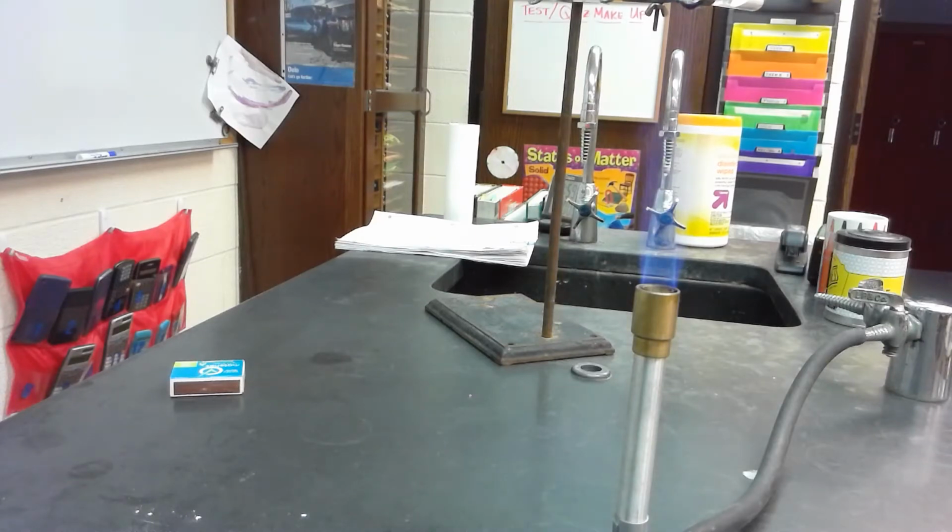All right, the last two reactions we're going to do are reaction 4 and 5. Reaction 4 is zinc and hydrochloric acid. Place approximately 2 milliliters of dilute hydrochloric acid into a test tube. To the acid, add a chunk of mossy zinc. Test the gas evolved with a burning wood splint. Discard the solution in the sink. Place any remaining zinc in the trash.